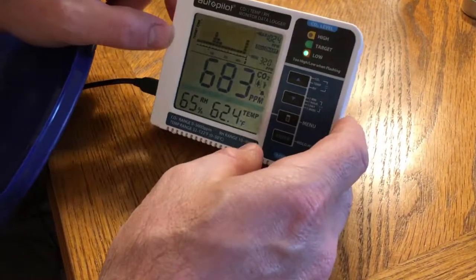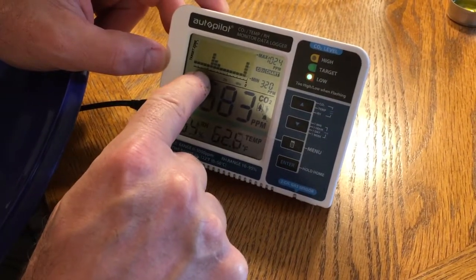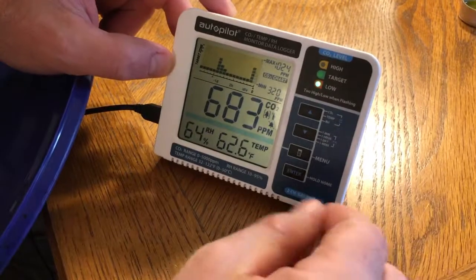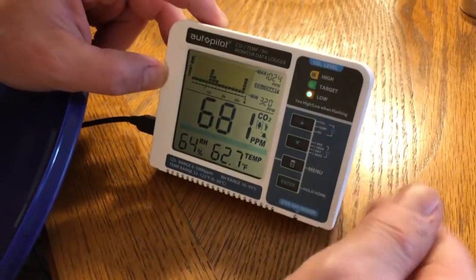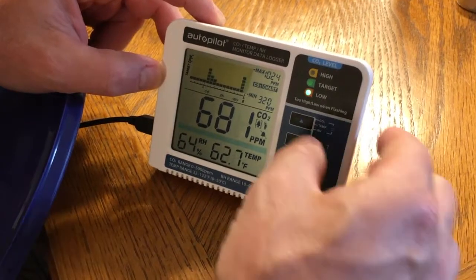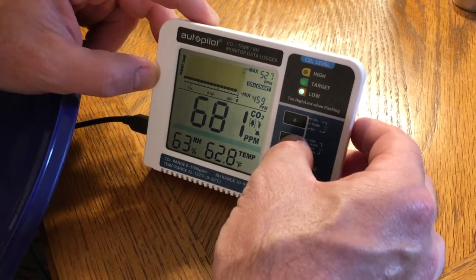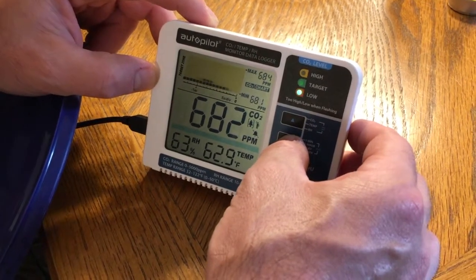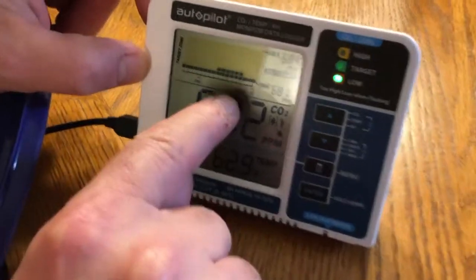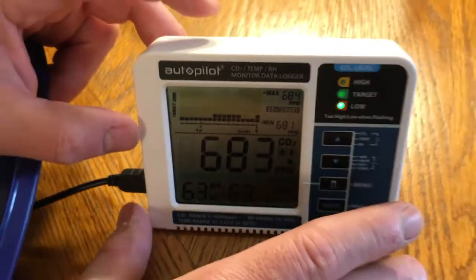If you look right, it's updating like fractions of a day. To change its settings so it's updating every minute, you'll press this down button and it'll change it. When you see that one minute or five seconds per division, that's what you want, so that you get rapid updates.